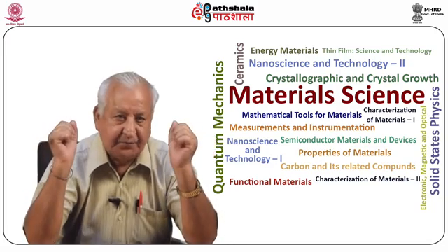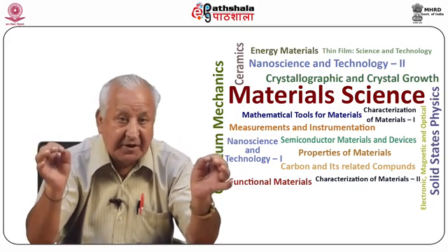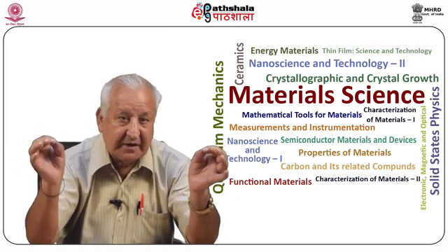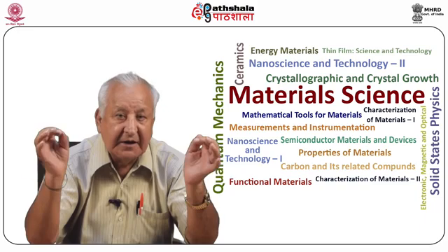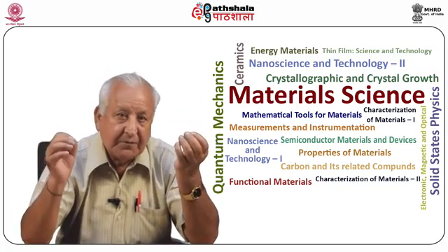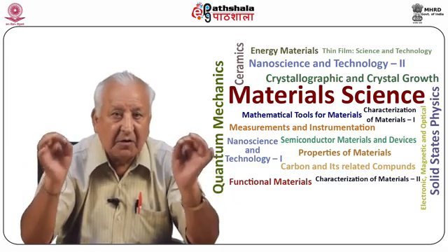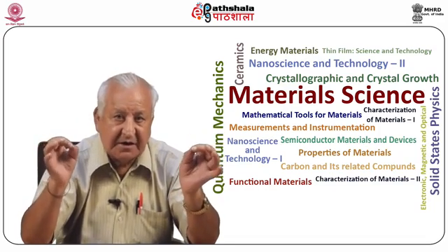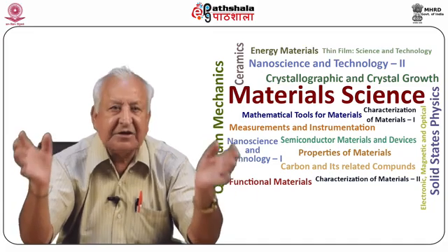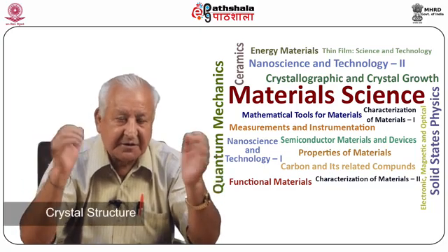The rotating crystal method. The powder crystal method is the most useful and feasible method for obtaining information concerning a material which cannot be made available as a single crystal. However, it is not suitable for the determination of internal structure on account of difficulty in indexing. Therefore, the rotation and oscillation techniques are used, provided the material becomes available in the form of a single crystal. This method enables measurement of lattice constants and indexing of reflections quite easily. The intensities of individual reflections are conveniently measured, which enables us to determine the crystal structure.